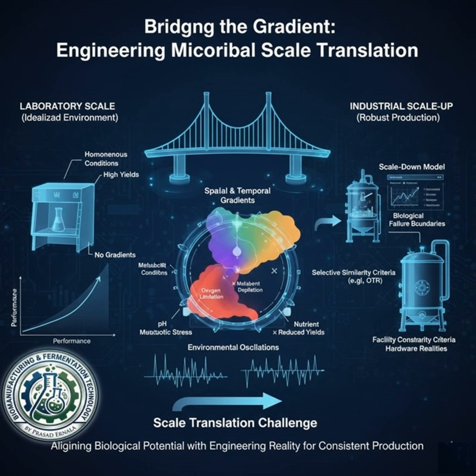It's a measurement artifact. And it means your DO reading actually becomes dependent on your stirrer speed. Speed it up, you strip the film, the reading changes. That leads to false oxygen security. The worst kind. You think you're safe, but the sensor is just too slow to catch the brief, lethal DO dips that are killing your cells. That is just a conspiracy of biology, engineering, and physics all working against you.